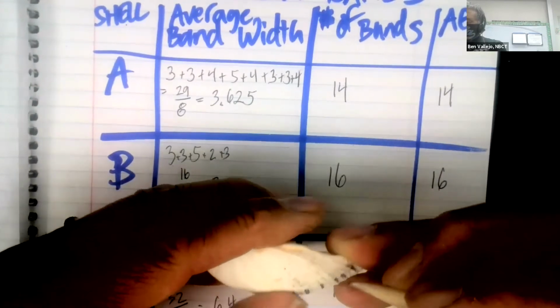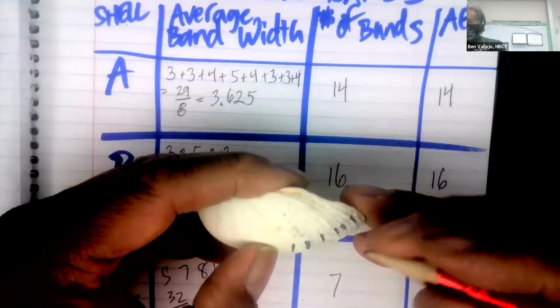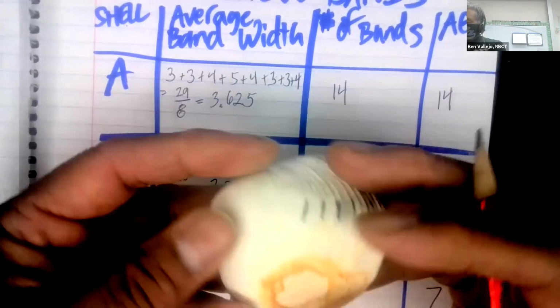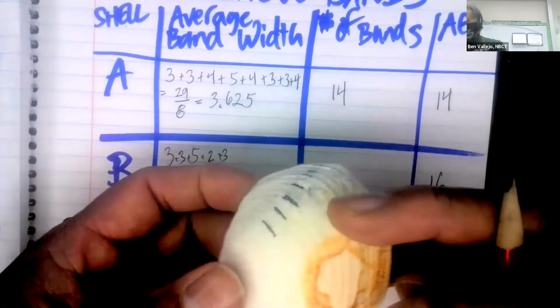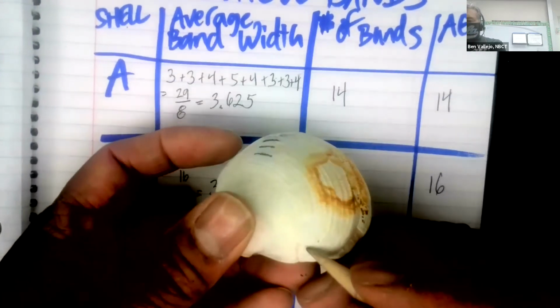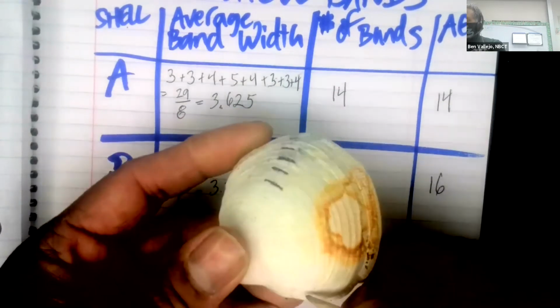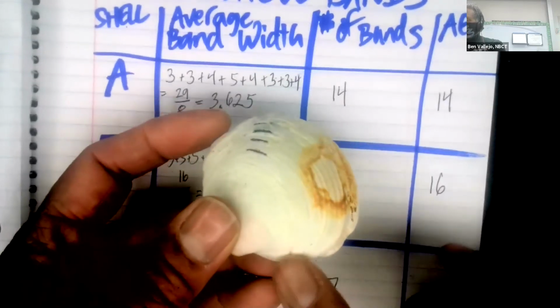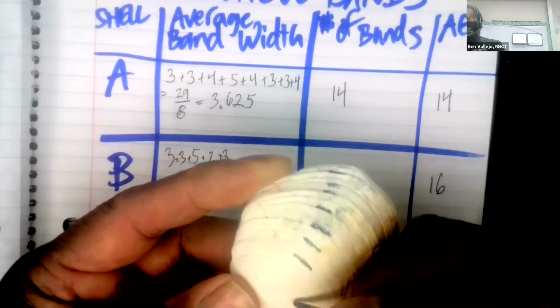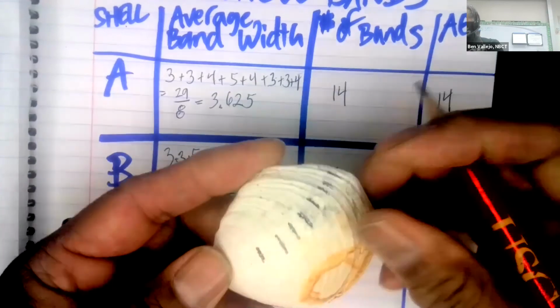There are some beaches in Central California that have larger clams, like the Pismo clam found in Pismo Beach. And I'm marking these, and you can feel them. And like I said before, you can see them on the edges sometimes, but this one's not as good at that. Well, here, this edge, you can see the band right there, and it moves over. That's it. Here's the other one. Here's the next one. And the next one would be, if I follow that along. Oh, that doesn't seem like an obvious band to me, but that's where it is.